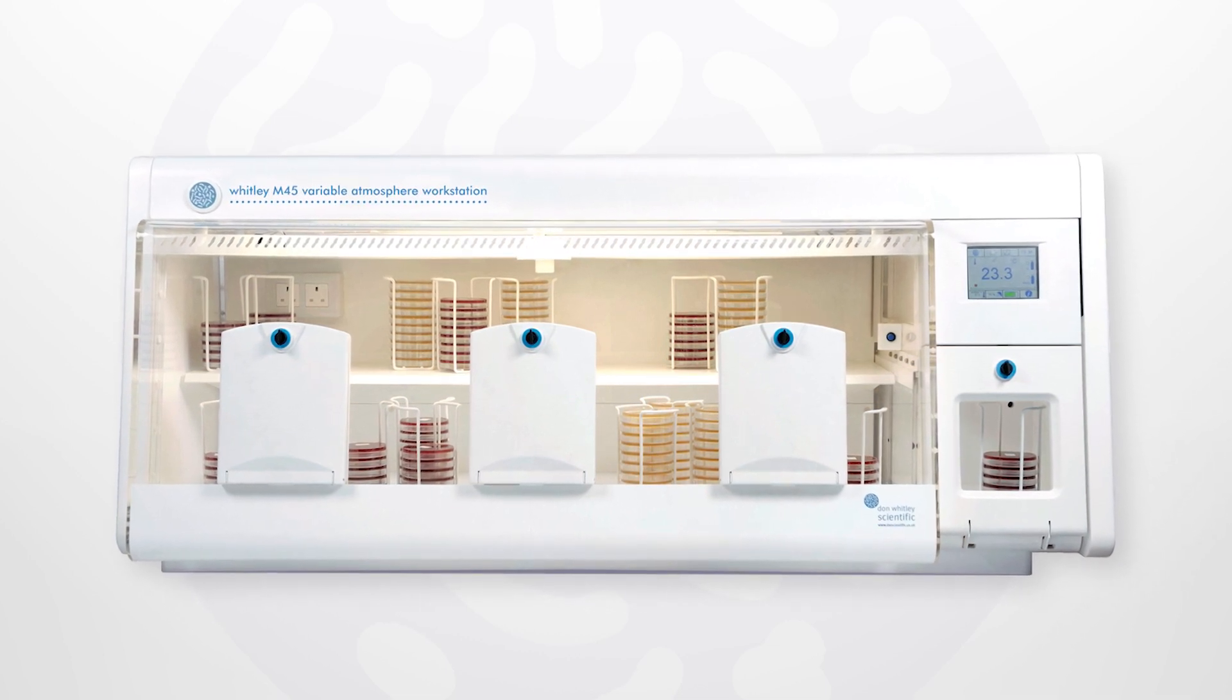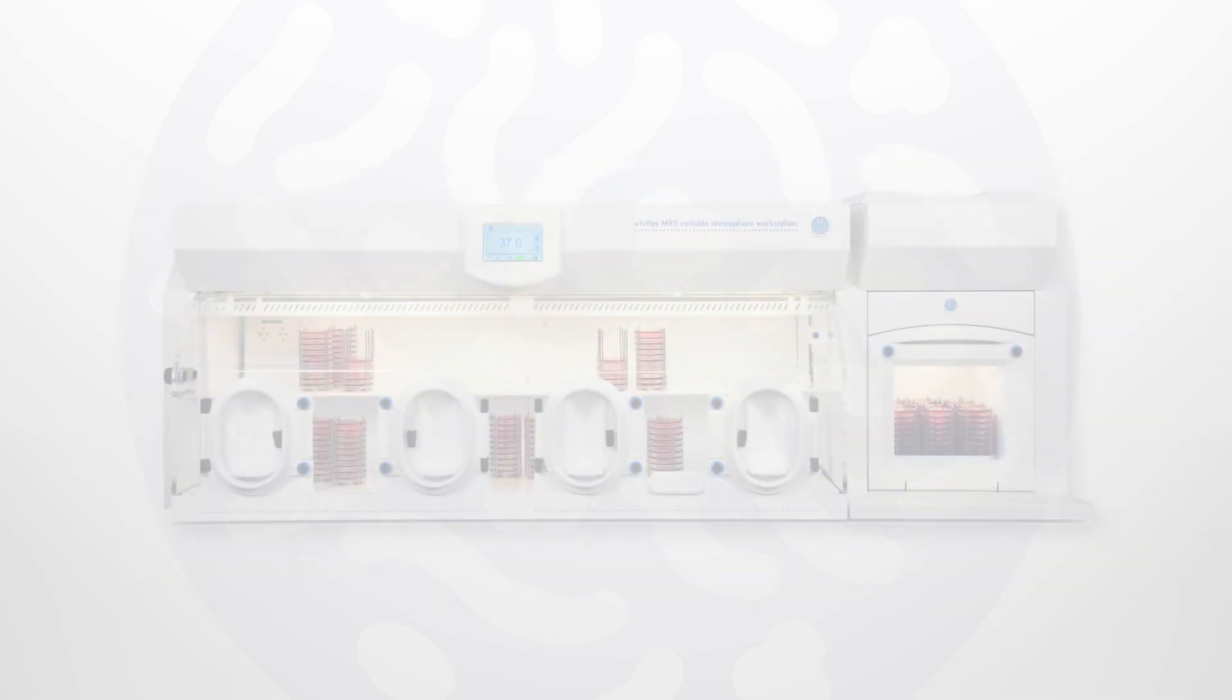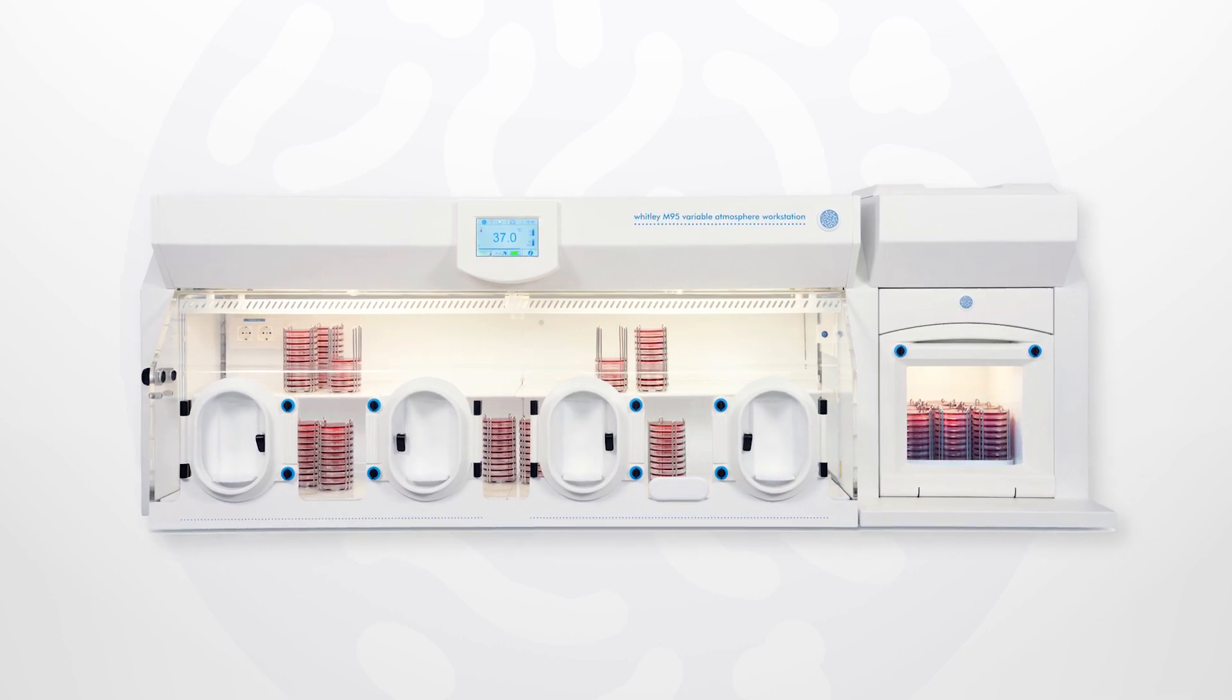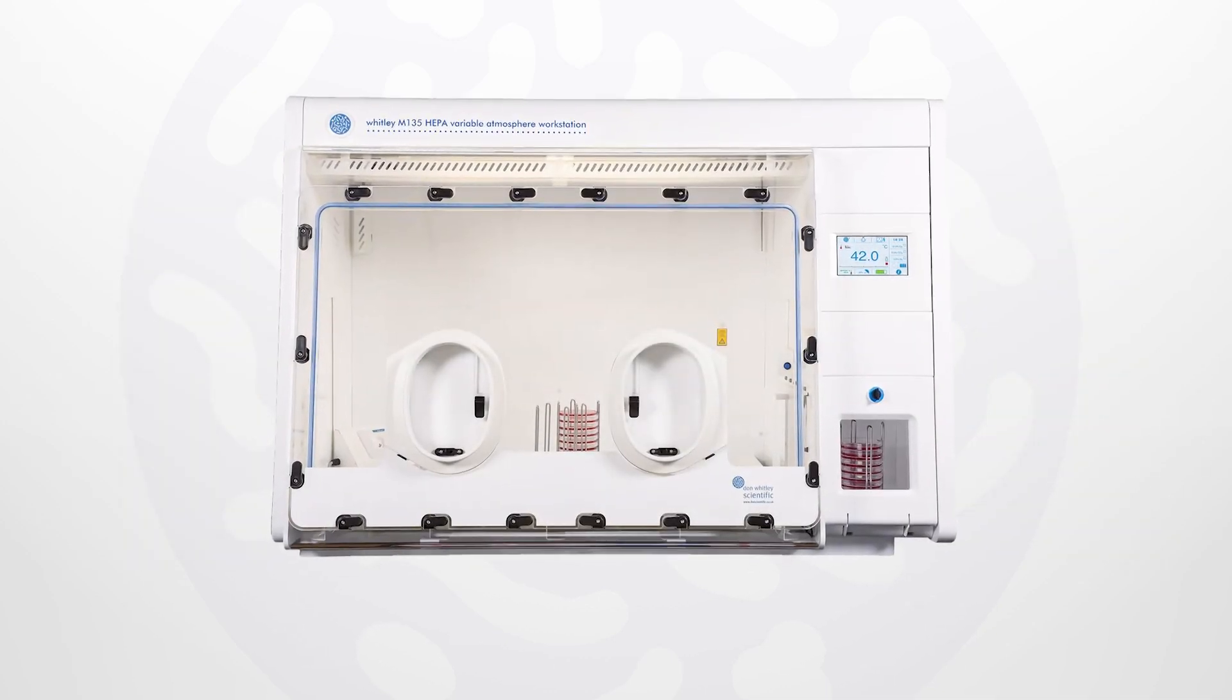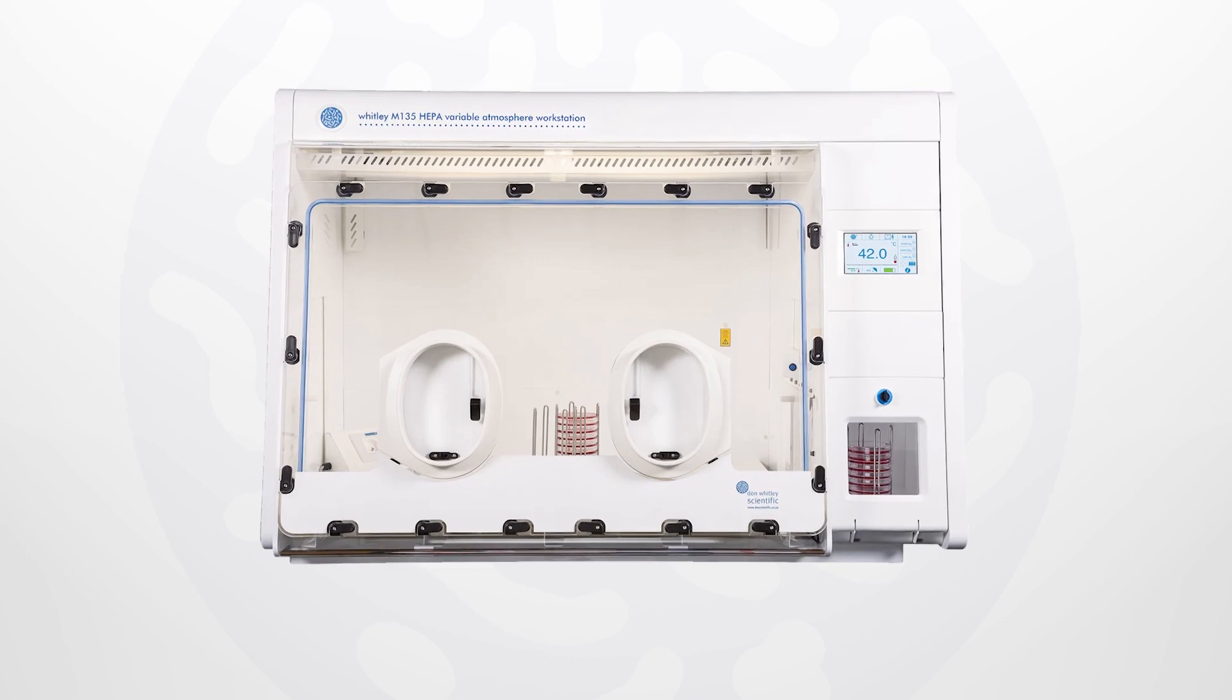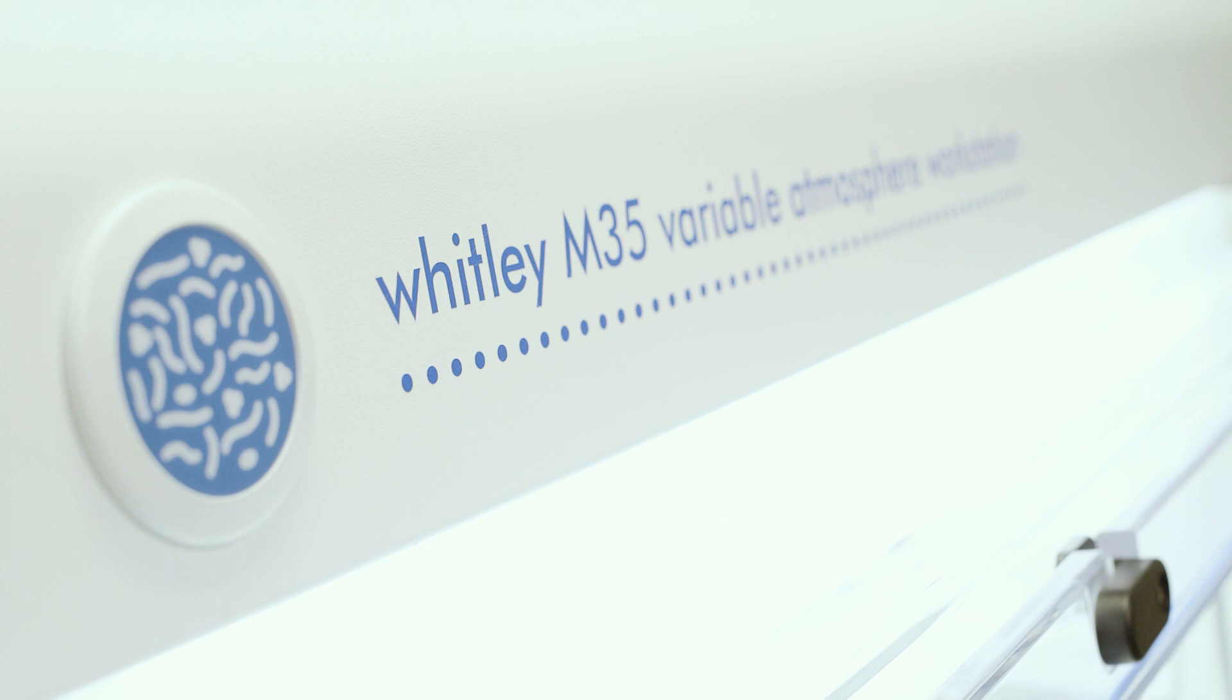Whitley microaerobic workstations which have a flexible four gas control system are used globally for diverse applications. These include the study of microaerophilic bacteria such as Campylobacter and Helicobacter, anaerobic bacteria and cell culture where physiologically relevant conditions are required.